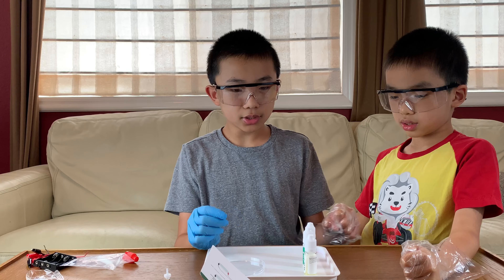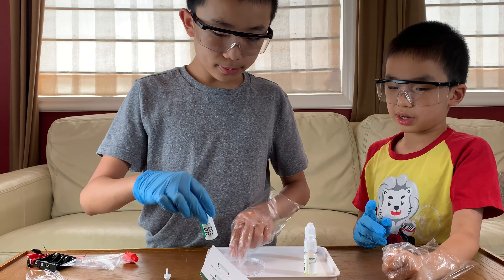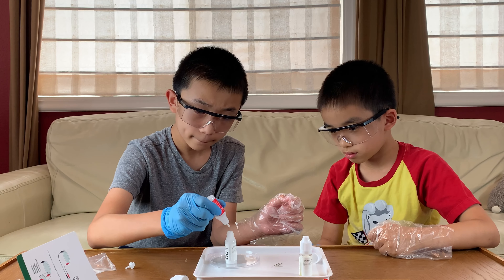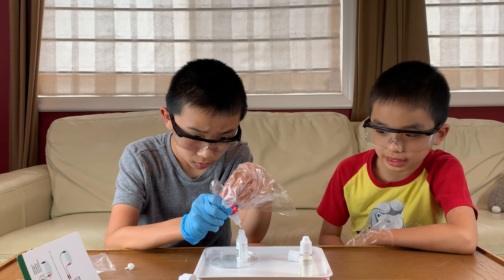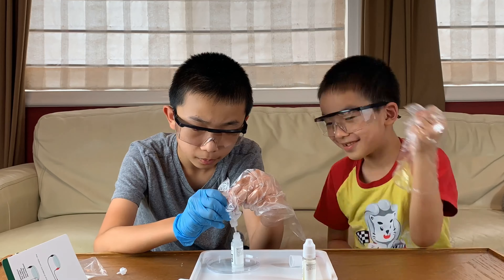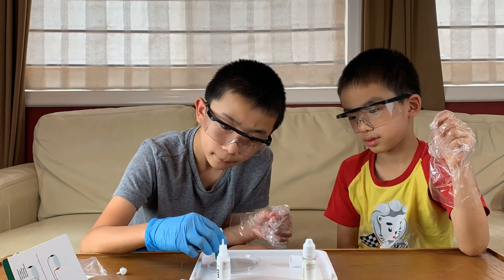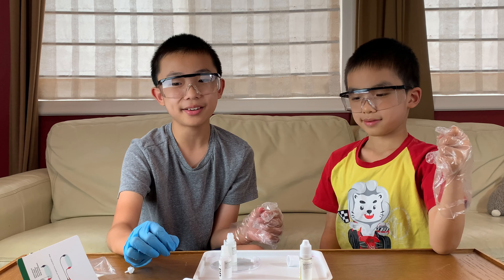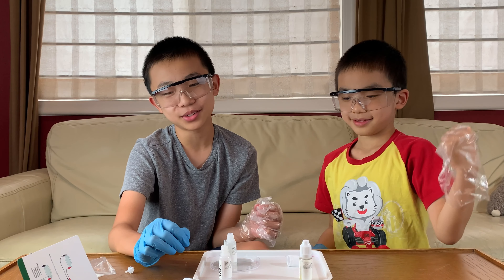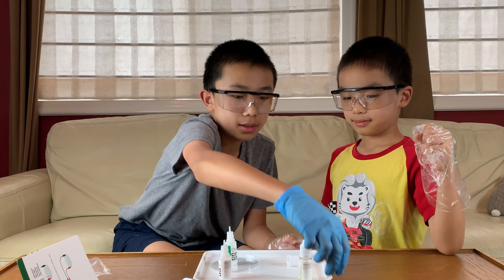We're going to start by pouring the red bottle into the green bottle. We used time lapse for that part. And we did it — it actually wasn't too bad. Now we use the red cap and shake it.